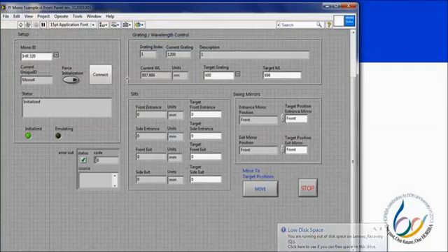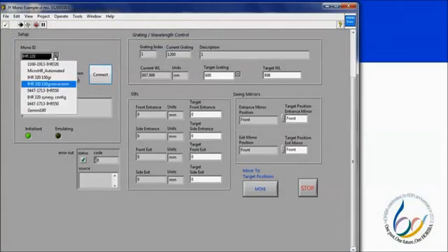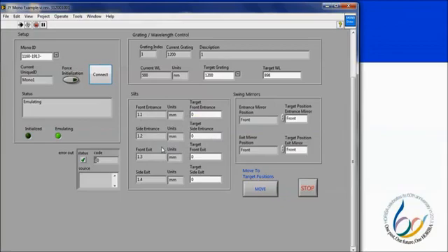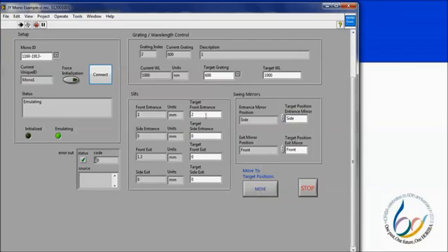If we now go back to the example VI, we see a user interface where we may choose our spectrometer and initialize. Here I am going to be emulating since I am not physically connected to a spectrometer. The spectrometer will then initialize and the grayed-out boxes become populated with the current grating position, wavelength, slit widths, and mirror positions. If I want to change any of the settings, I input new values in the white boxes and then click move to move the motors to the appropriate positions. The grayed boxes are now updated with the new current values.